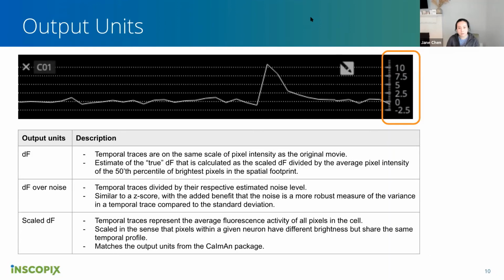So when you're analyzing the whole video, you're getting a lot of other activity that may not be related to what you're interested in. And like Shay was saying, a Z-score calculates all of the spikes throughout the entire movie. So how important is it to crop the image before all of the processing, or is it okay if they're processing everything, and then after they've selected ROIs and done all of these analyses, to then just take a snippet of that processed data?